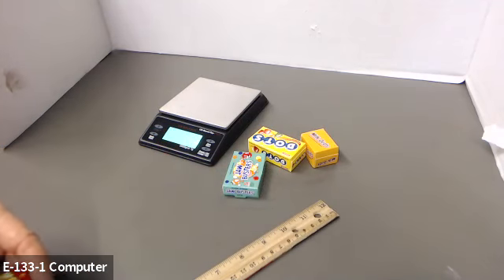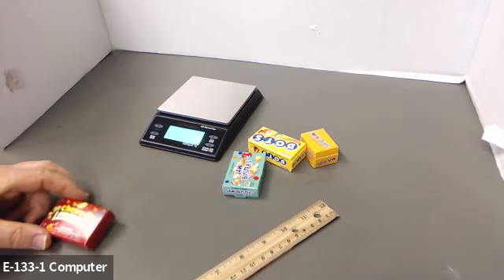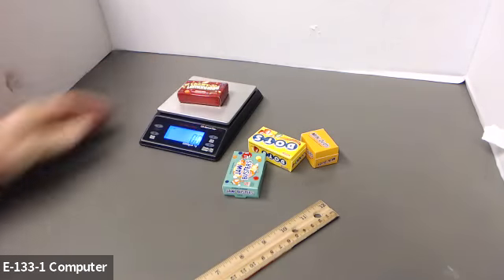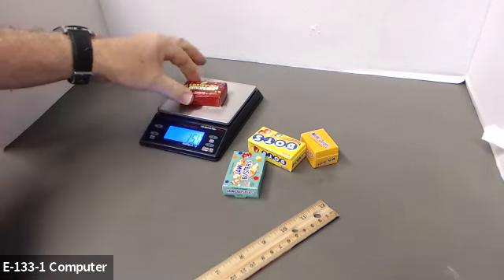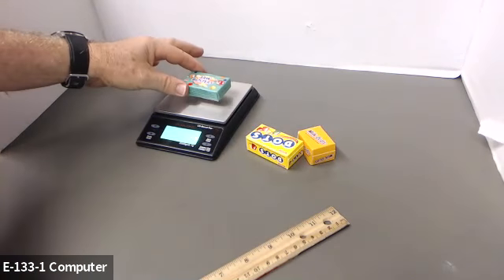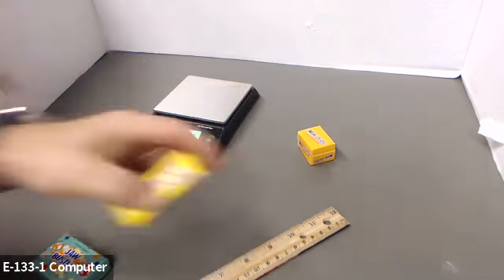You may not be able to tell, but the balance says it's at 0.0 grams. We're going to start with the chewy lemon heads, and I'm going to put those on the balance. I get 15.4 grams for the full box. We'll take that off. For the jaw breakers, it's 15.3 grams. These are the fulls. Go back to 0.